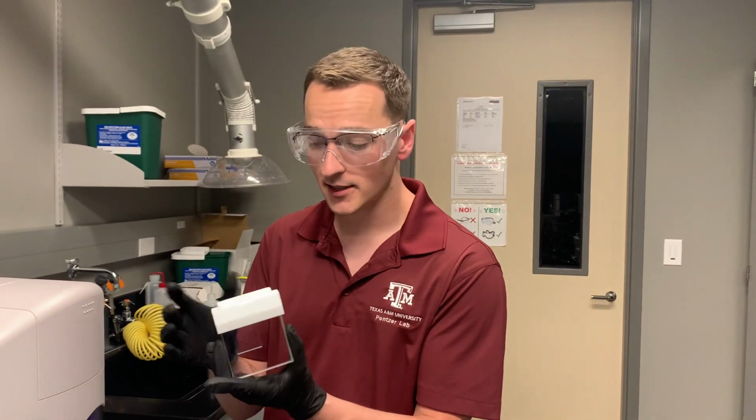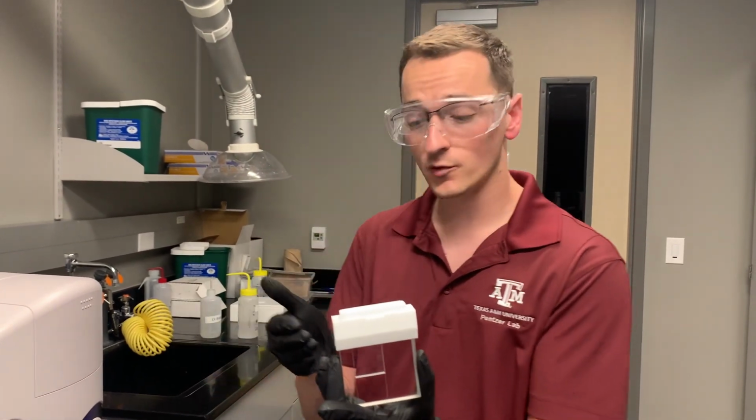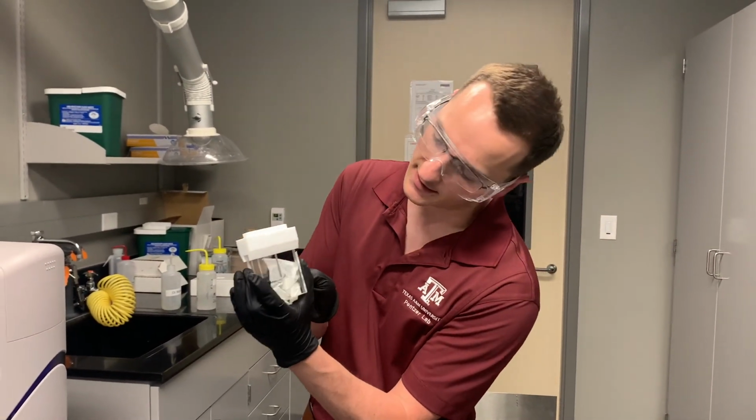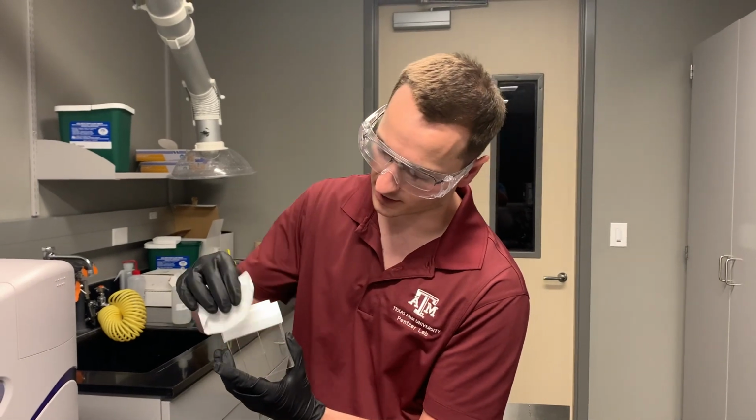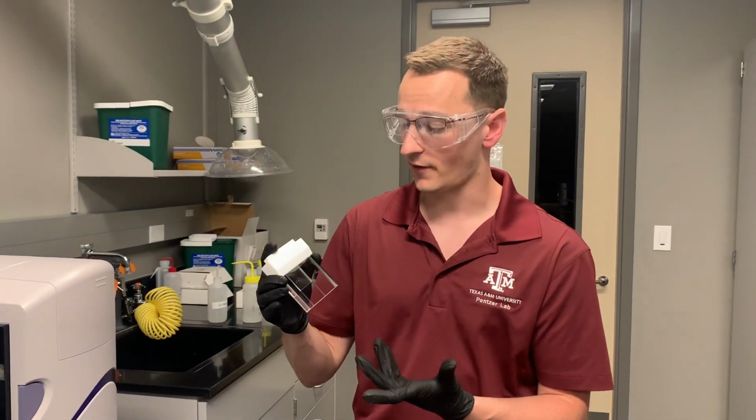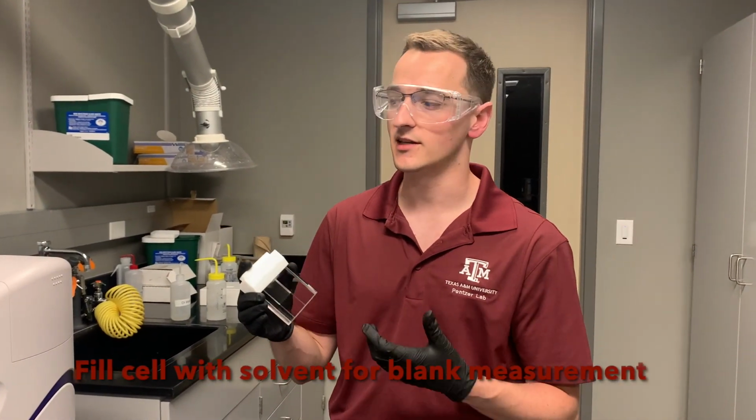And for the outside, because the laser has to pass through the window, you're going to want to make sure that there's no smudges or fingerprints on the window itself, and you can do this by just gently cleaning the outside of the glass with a Kim wipe, like so. Next, you're going to want to go ahead and fill the fraction cell with the solvent of choice, in this case methanol, and place it back into the instrument to collect a blank measurement.